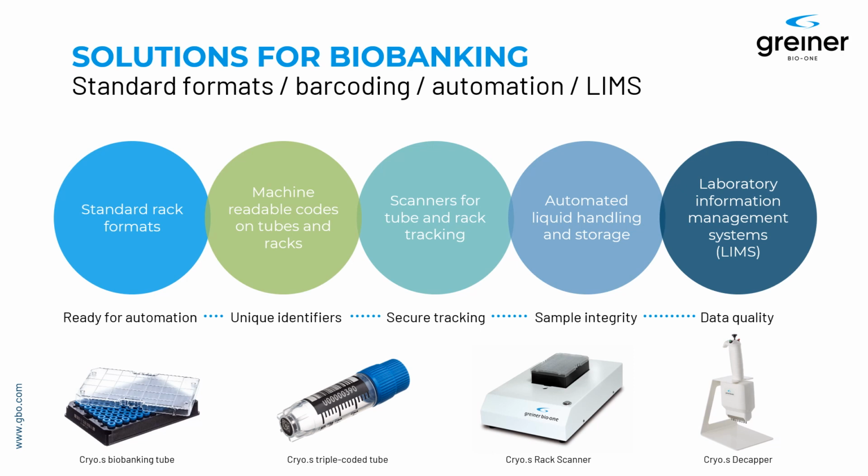Everything can then be transported into laboratory information management software. And so at any time, these tubes in the process can be identified, and it can be recorded what happened to them and how they were processed. And I already mentioned that laboratory information management systems are often at the core of everything. These are software programs which allow for the integration of tube identifiers, rack identifiers with processing data, with storage data, and even with analysis results at the very end of the workflow.